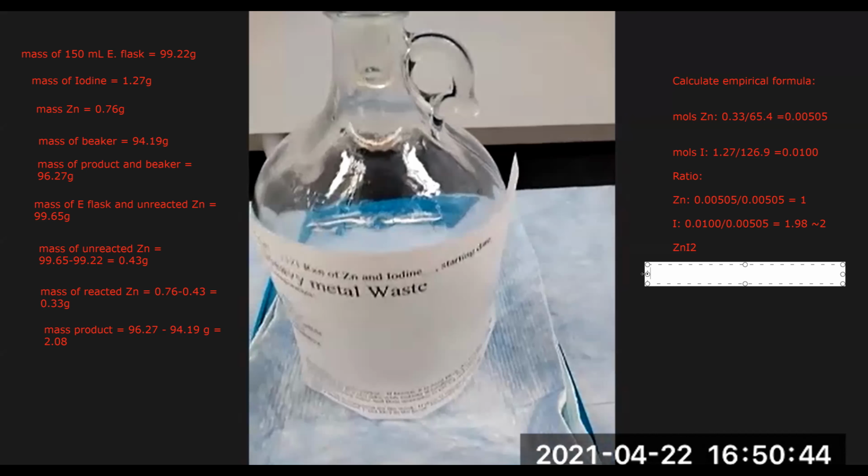So now to calculate the percent difference, we need the mass of reactants. And so the mass of reactants is the mass of reacted zinc plus the mass of iodine. And we get 1.60.